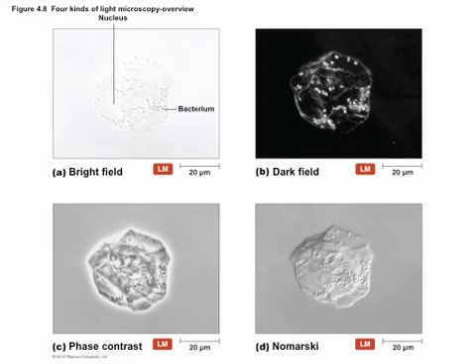This down here is a phase contrast image. So this is still bright field, but it's using that phase contrast trick. And you can see how it kind of makes the edges glow a little bit. So anywhere there's a phase change, anywhere there's a boundary, is going to be slightly luminescent. So you can tell where organisms stop and start much easier.